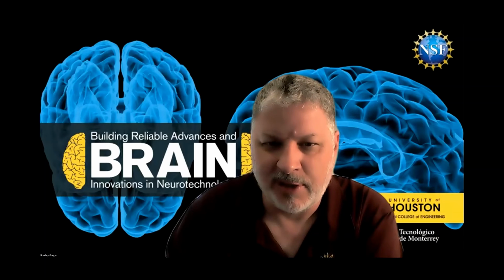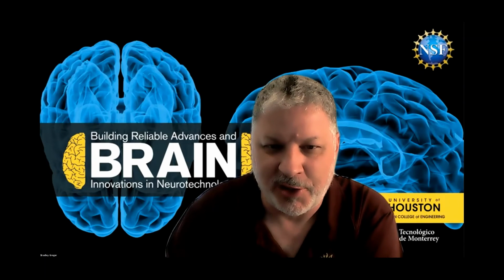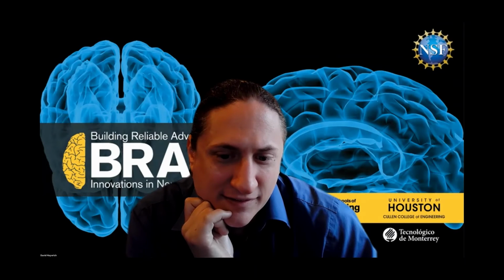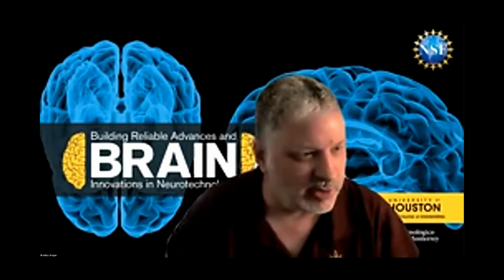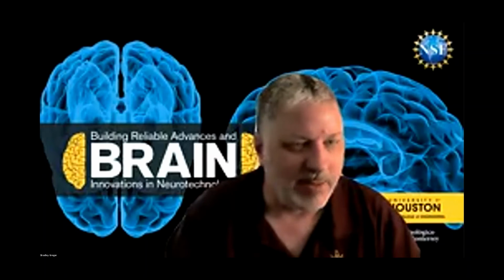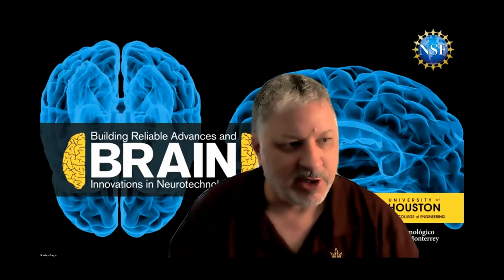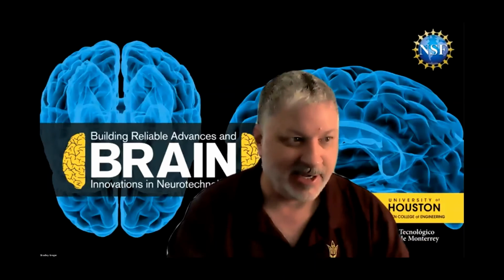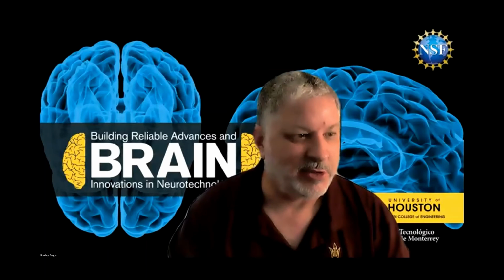I have a very self-serving question. The reconstructions of the 3D tissue that you're doing, how possible would that be to do with actual human cortical tissue? And then my question became, is that saved as like a mesh? Because I'd love to then incorporate that data into some modeling of the electrophysiology and that sort of thing.